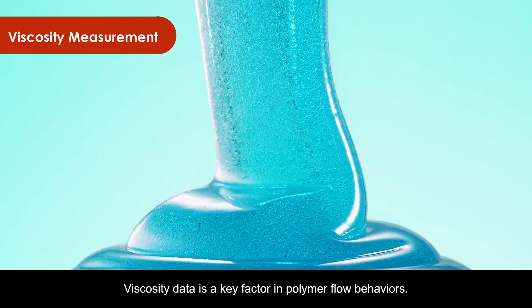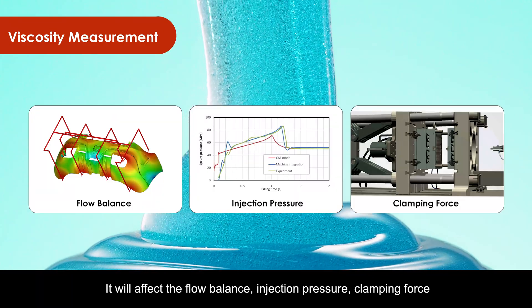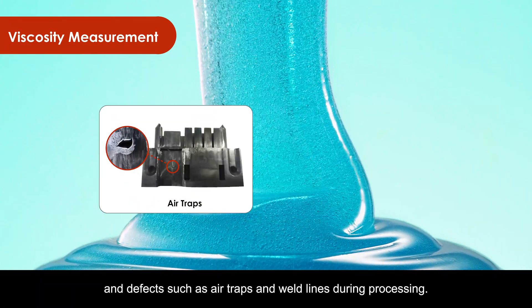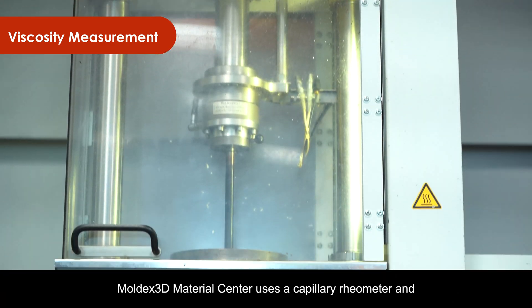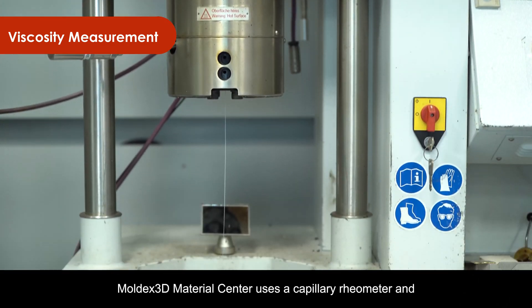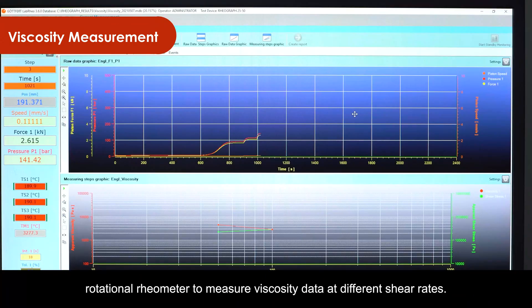key factor in polymer flow behavior. It affects flow balance, injection pressure, clamping force, and defects such as air traps and weld lines during processing. Moldex3D Material Center uses capillary rheometers and rotational rheometers to measure viscosity data at different shear rates.